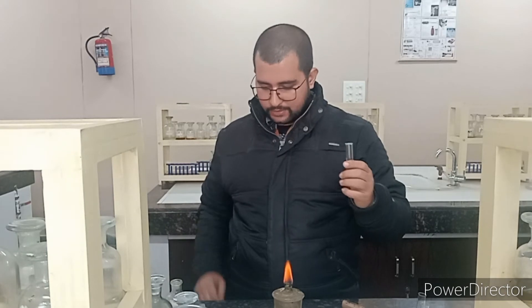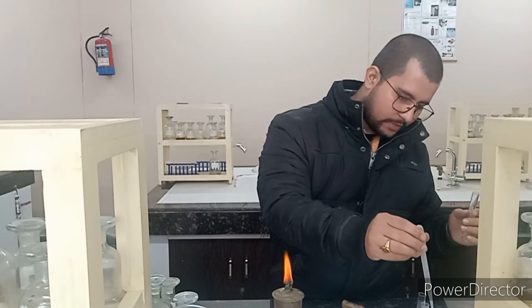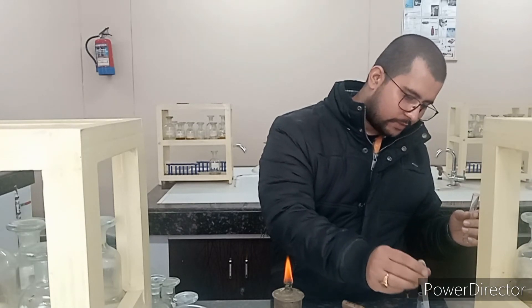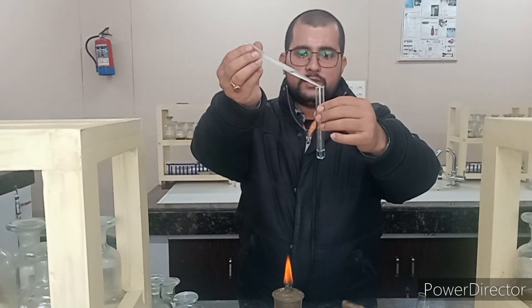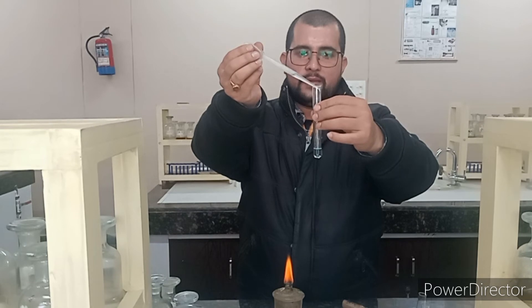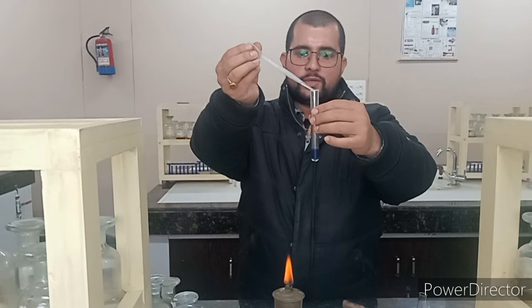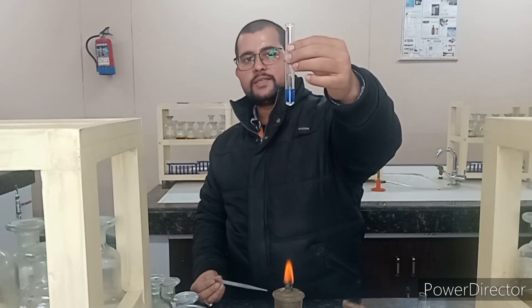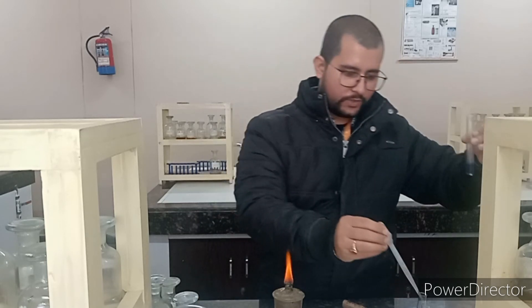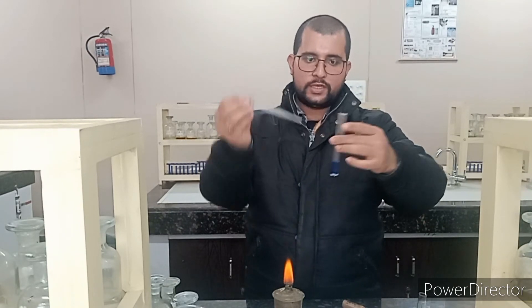Now we have to cool it down and then add NH₄OH — ammonium hydroxide — in excess. I am adding ammonium hydroxide drop by drop. Just observe which color is appearing — a deep blue color is appearing. So it is showing that copper may be present here. A very good blue color is appearing. When you add a little bit more, it will become even more blue and the whole solution will be bluish in color.